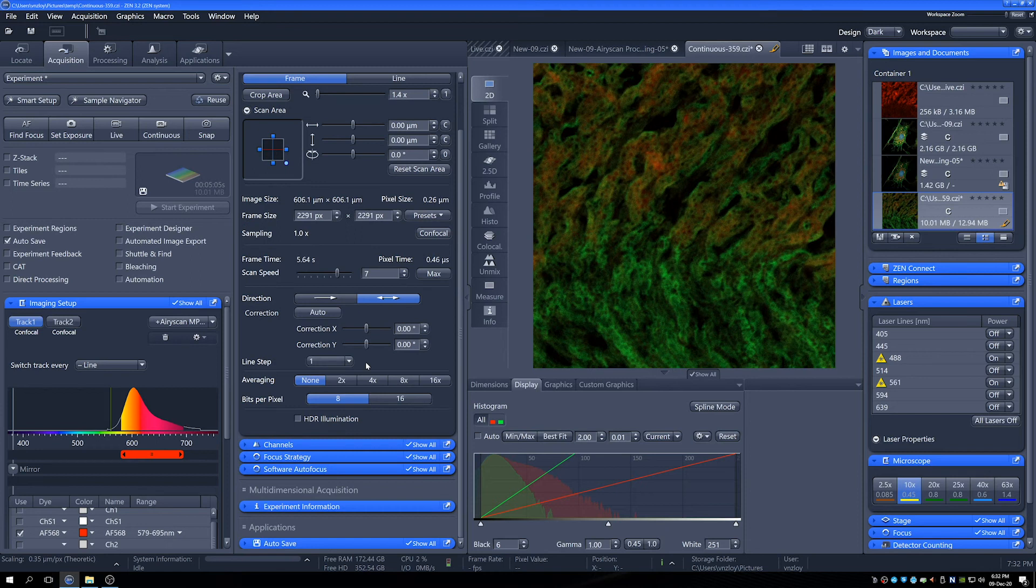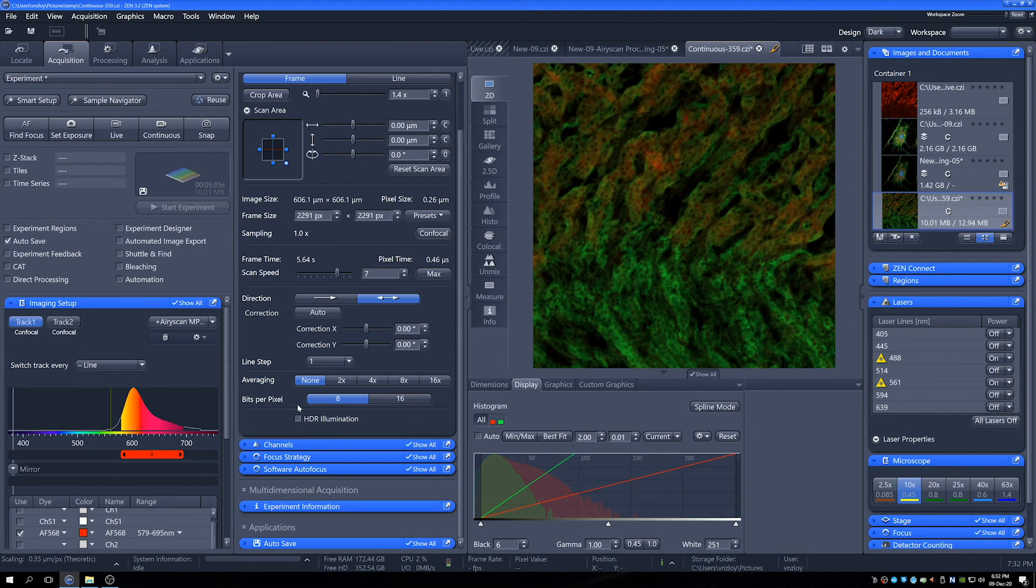Then we have things like averaging that we can use. We've got two to 16 times averaging that can be used. Nice for improving your image quality. And then finally, we've got bits per pixel.